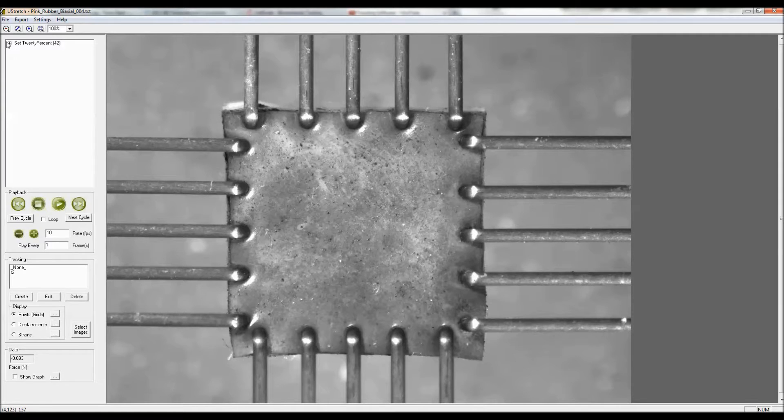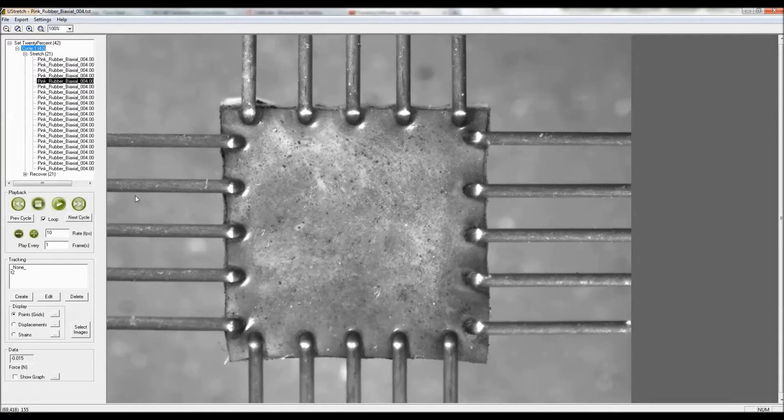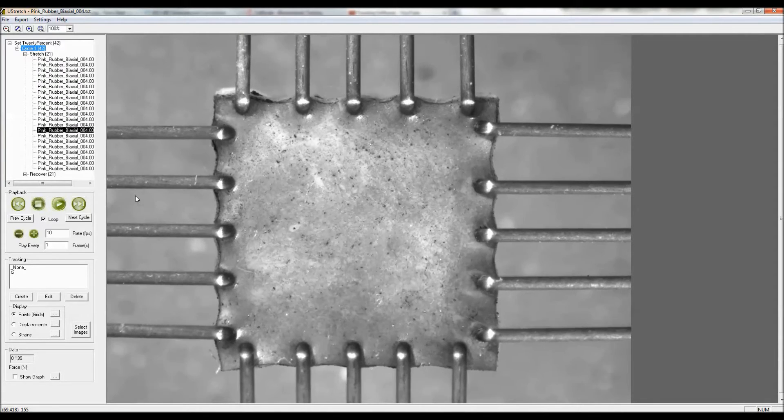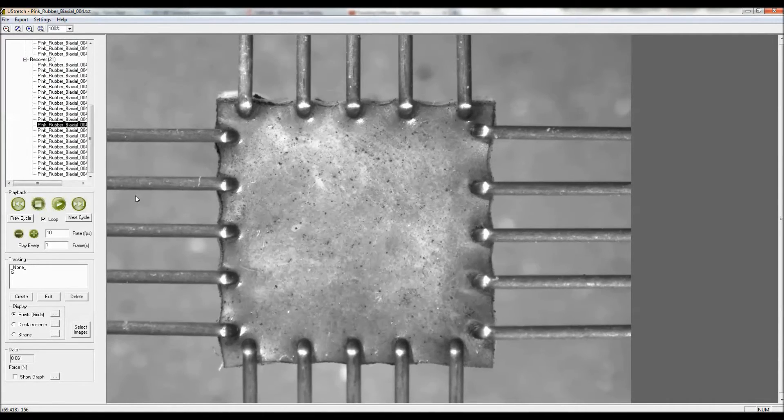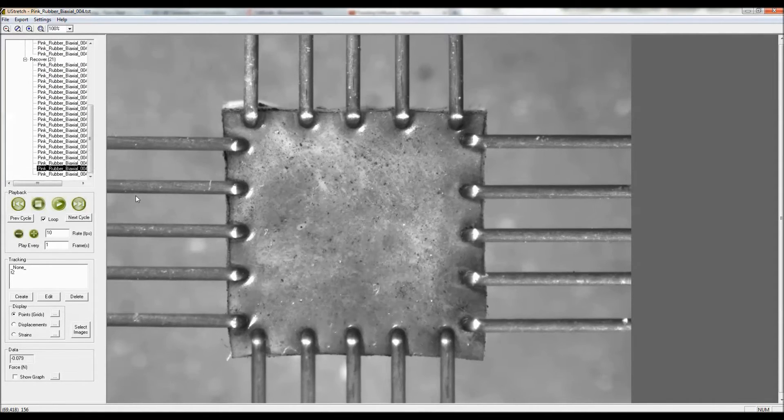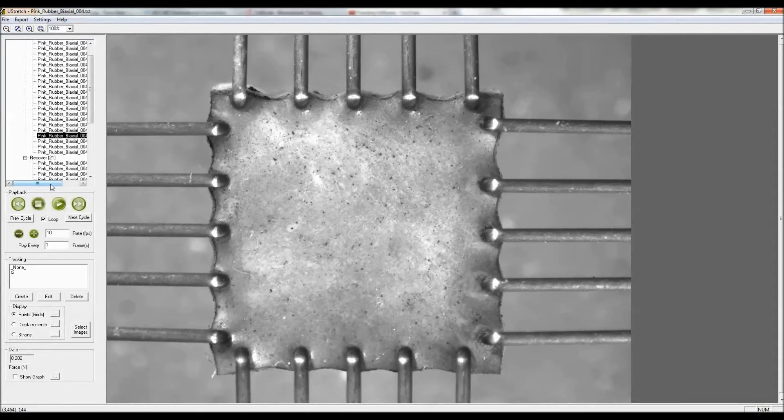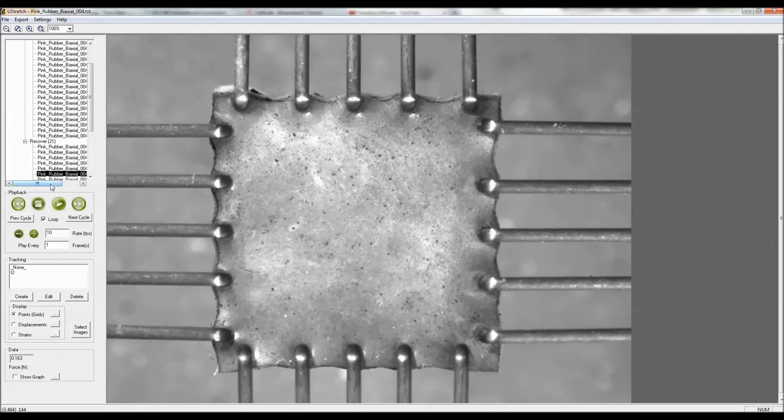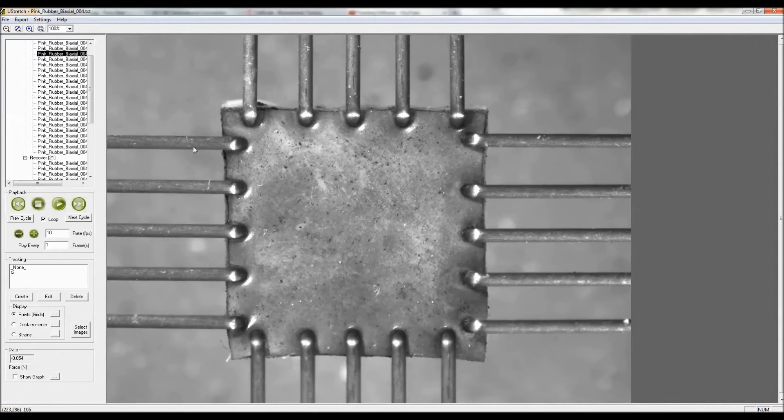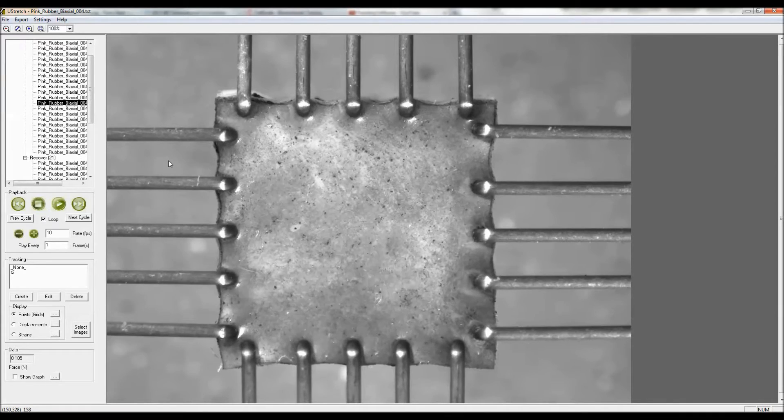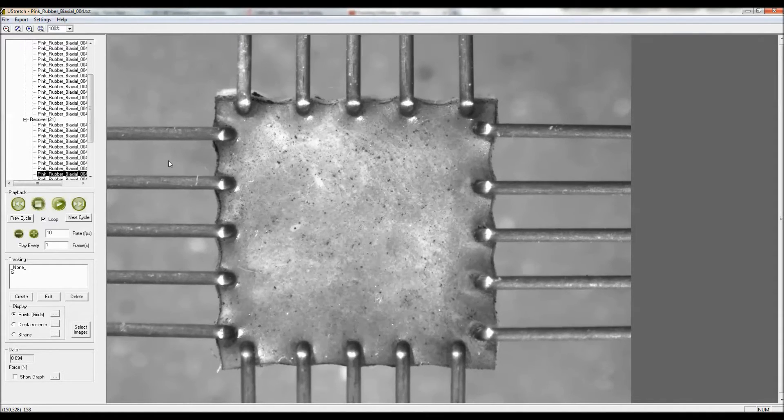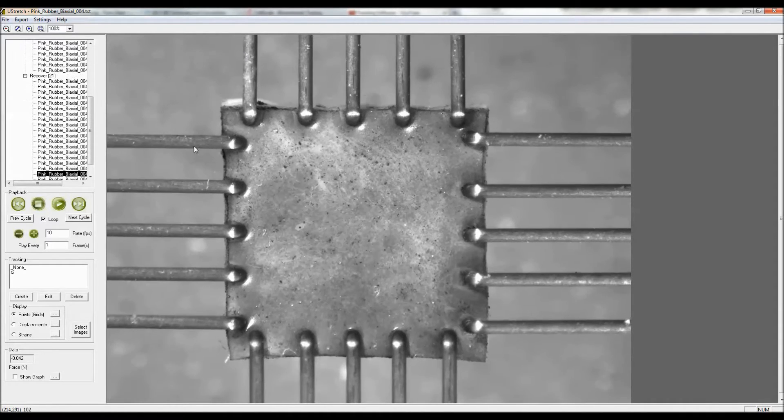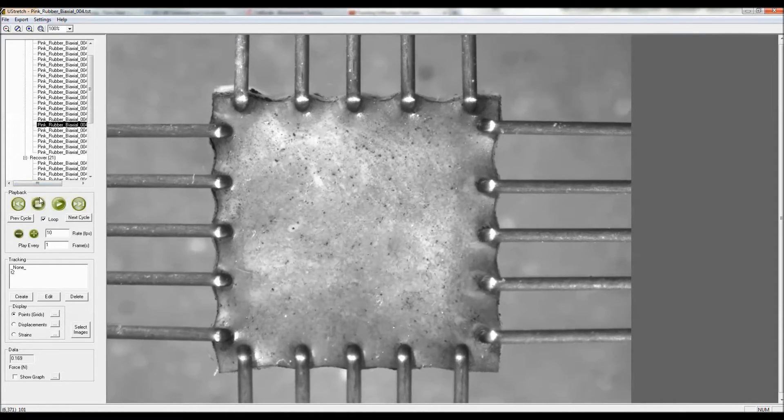What was done in this test was to do a single cycle where it was stretched from its initial configuration to 20% equibiaxial strain in 20 seconds, and it was held in place using BioRake grips which are five tines with one millimeter spacing.